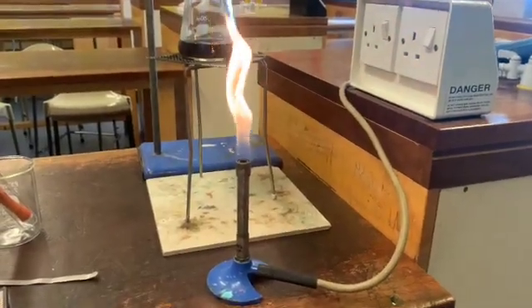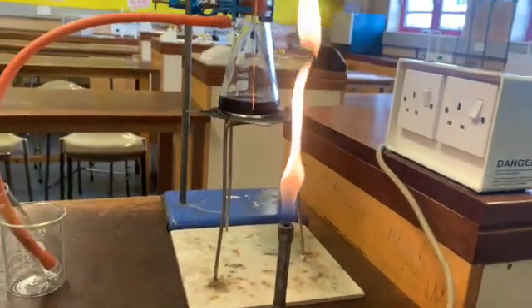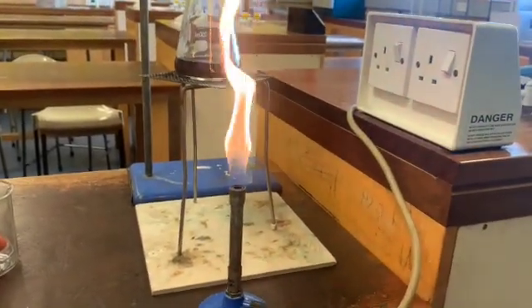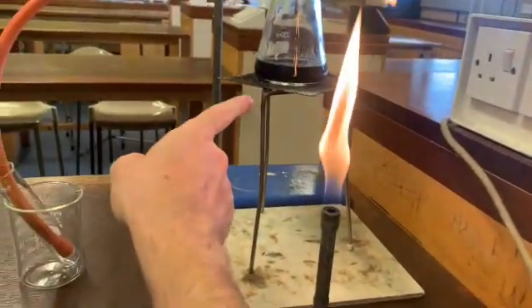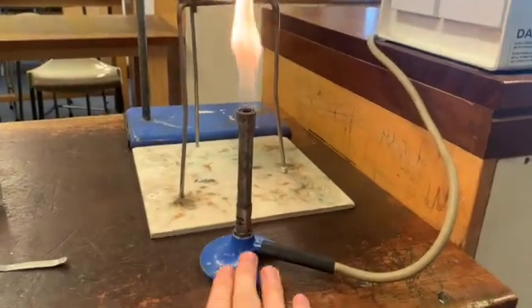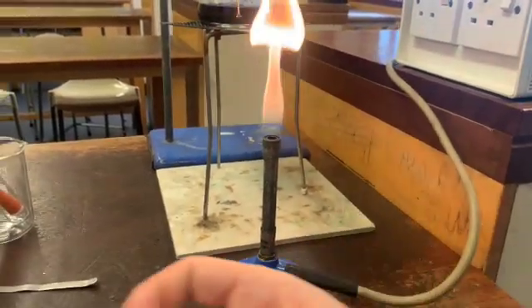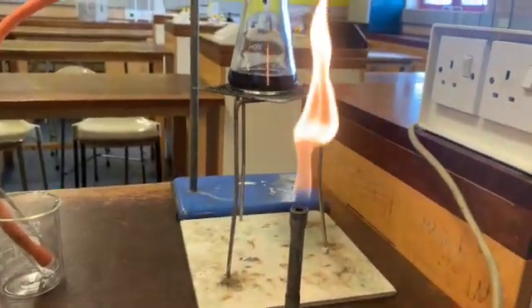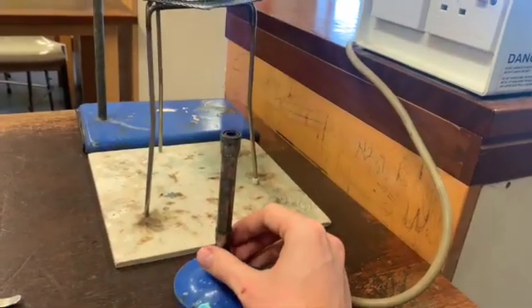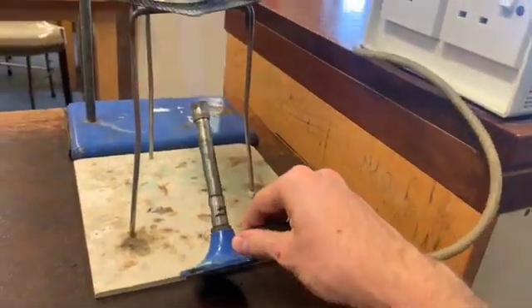I've just lit my Bunsen flame, and I did that outside of the tripod - it's not underneath at the moment. You never want to light a Bunsen underneath the equipment that you're using. Just light it outside first, even if it's not on the heatproof mat, that's still okay. Just make sure you change it to the flame you're going to be using and move it under as you're doing the experiment. I'm heating a liquid and that means I want this to be quite a high power flame. I'm going to change it to the blue roaring flame and start putting this underneath.